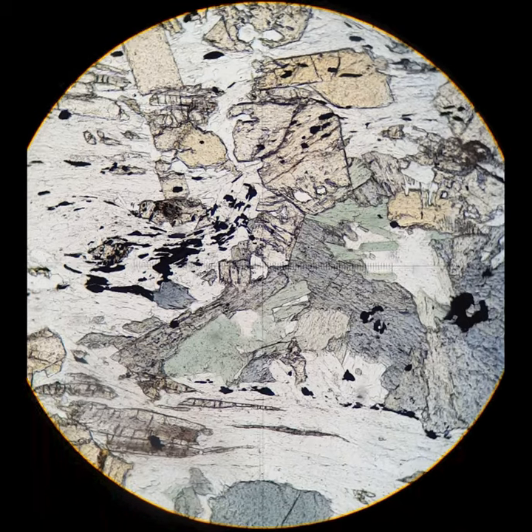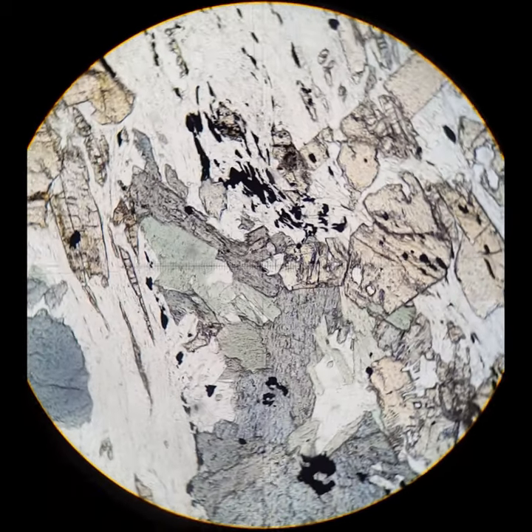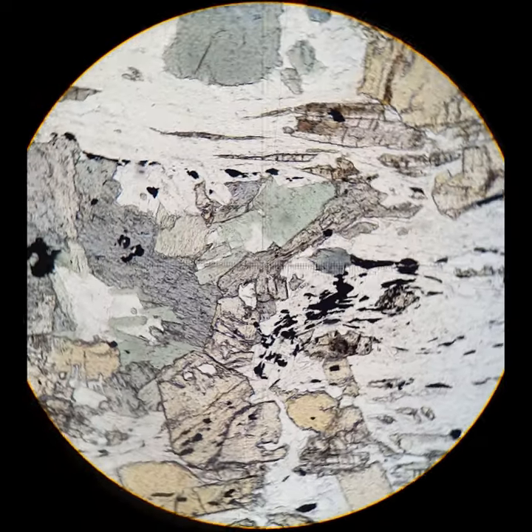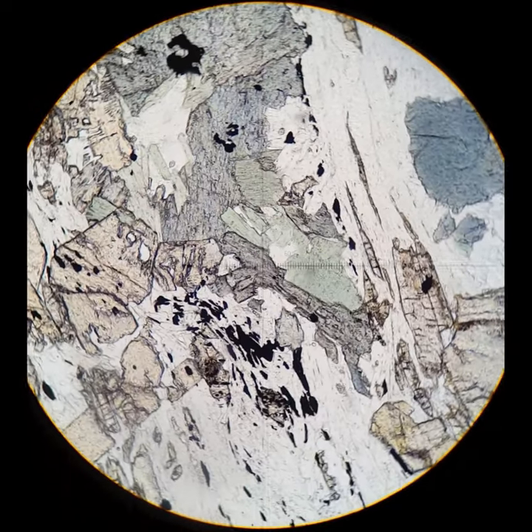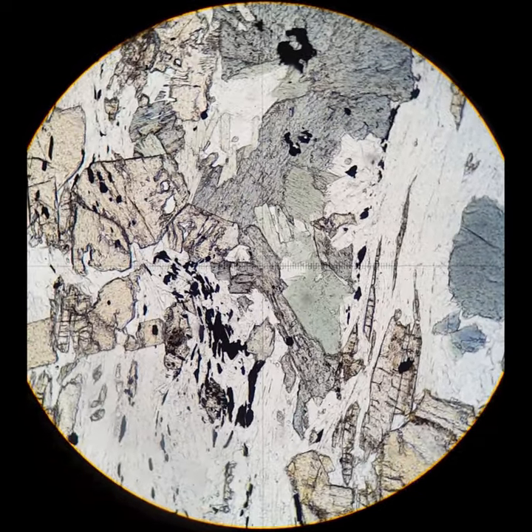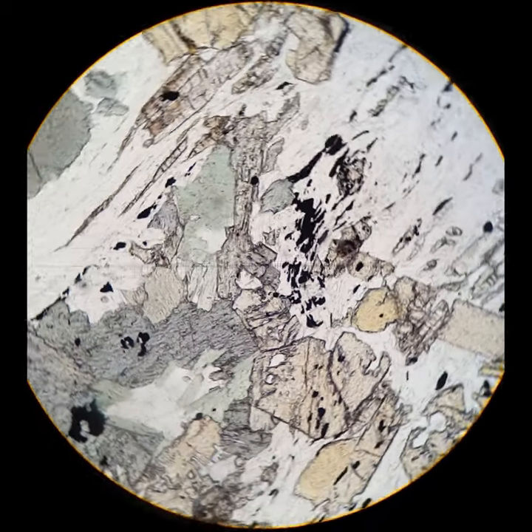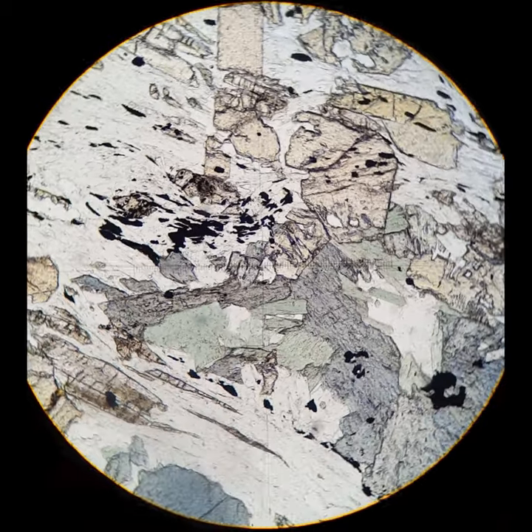I use pleochroism all the time to identify metamorphic minerals. Here I can clearly see three different minerals: one is blue, one is green, and the other is yellow. And from those colors in pleochroism, I can identify what they are.